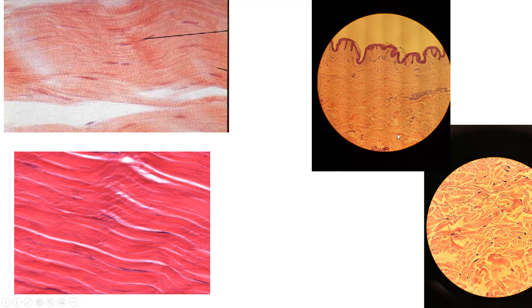Over here is dense irregular, so in this slide, this part of it, this is dermis of the skin, and then also here's a close-up which looks a little bit better. So dense irregular connective tissue, irregularly arranged collagen fibers. Big place that we have it is going to be the dermis of the skin.